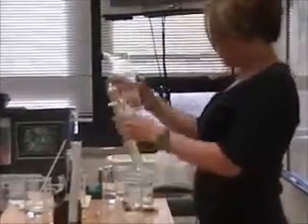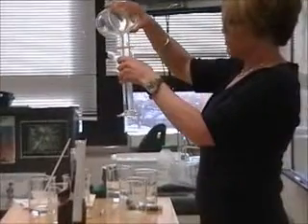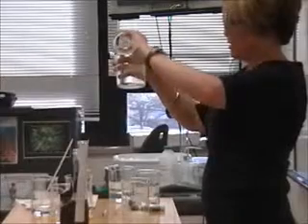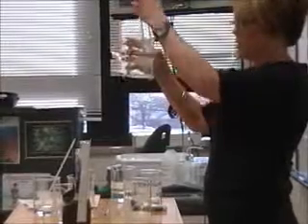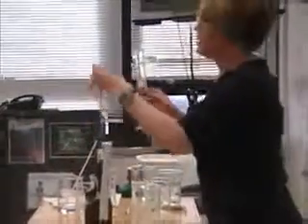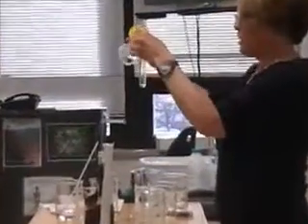And then we're at our B solution. Whoops, it's a little too much of that. Okay, get your fingers on the yellow button and start.